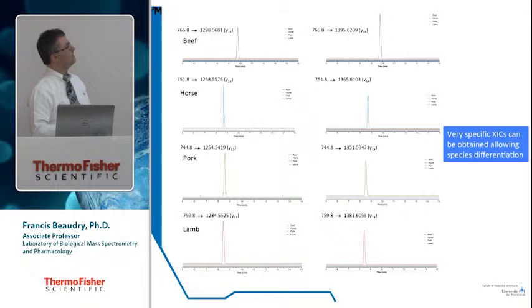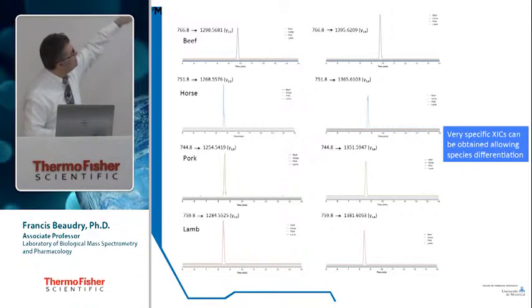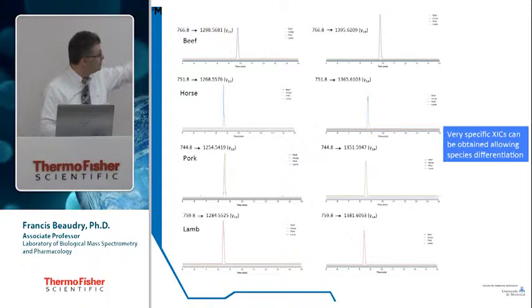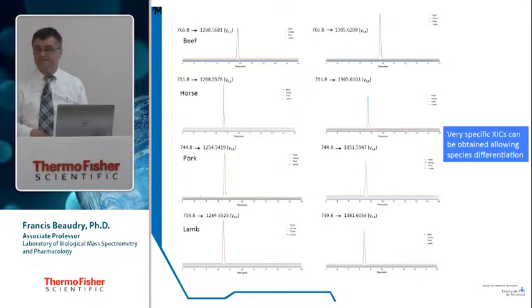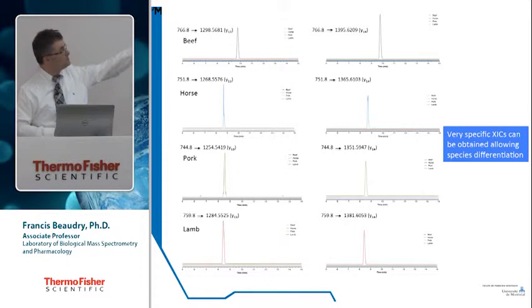So when we do this, and that's exactly what we have done there, here it's a 10-minute window, before that was 47, that's why the peaks don't look exactly the same. But you get the Y13 and the Y14. The other colors at the bottom are the other species. In this case, this is beef, and you see the large peak for beef, but for all the other species, when I extract the same masses, I got nothing. It's very, very specific. It's the same with pork. I can see there's no interferences from other species. Very, very specific. And I can see this with Y13, Y14 for each of the species we test.